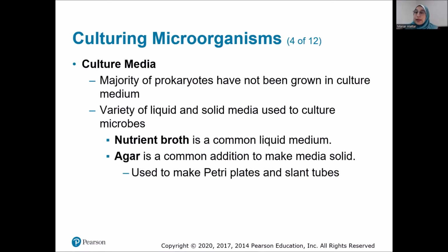So once we have these isolated colonies, then we oftentimes want to maintain them on various types of tubes or plates in the lab, okay? Whenever you're growing a microorganism, you grow it on some sort of liquid or solid that has the nutrients that it needs to grow. And if it's a solid, it also has an agar in it that solidifies that nutrient base, and that allows you to see visually the colony structures or the colony morphology of that growth. Or in the case of a slant, which we'll talk about in a minute, just see that there is growth.